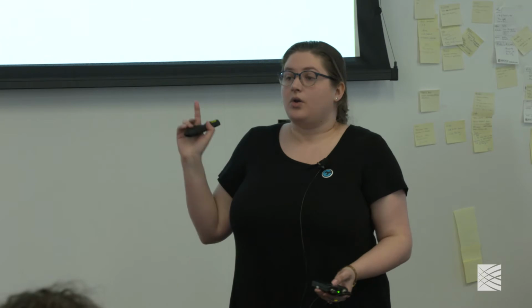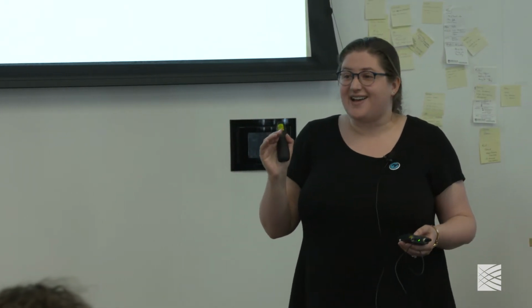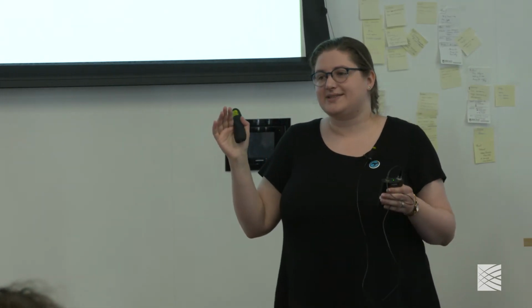So I'm actually interested in germline copy number variants. And it sounds like this is less of an issue for the germline, right? You're talking specifically about single nucleotide variants. Yes. Right now we're talking just about single nucleotide polymorphisms. But you're going to hear the words panel of normals used a lot, and it actually means a very different thing for the MuTect pipeline than it means for the copy number variation pipeline. They're both using the same concept that we want to remove artifacts that we see in a bunch of normal samples.